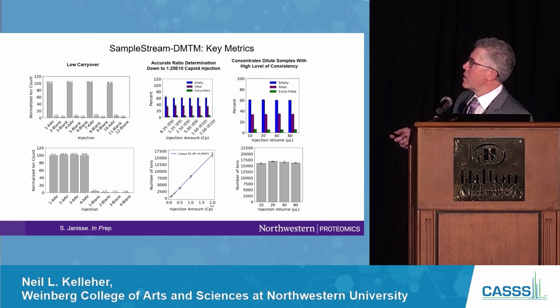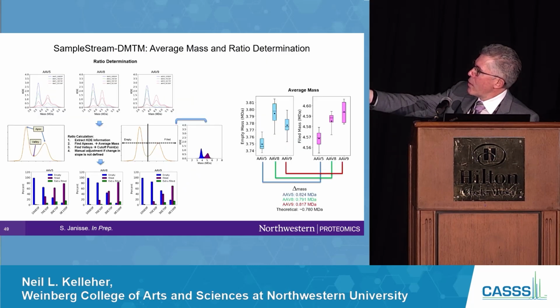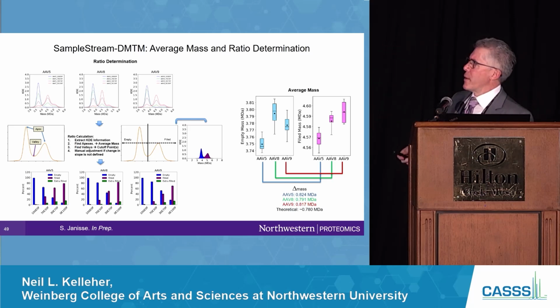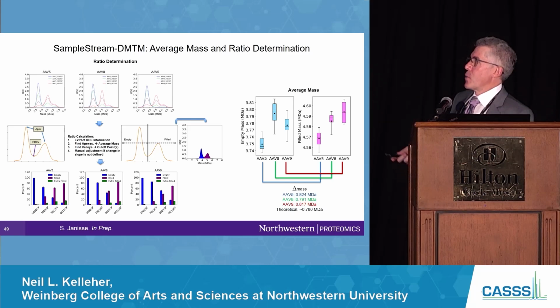Okay. Are you able to see any partial fill-in? Yeah, so, and double filled. So I think if we go back, you see that's double. And the partials, in this higher flow rate regime, we kind of obliterate that partial. I think that's due to partial filling as well as lack of desolvation or other things I have to wave hands about. And we're automating this report, and the whole system was, automation robustness was the top goal, and so we didn't stop to optimize that. But we have seen it, if you go really low flow rate, you can start to see those depending on which AAV. But we do see robustly the double filled.